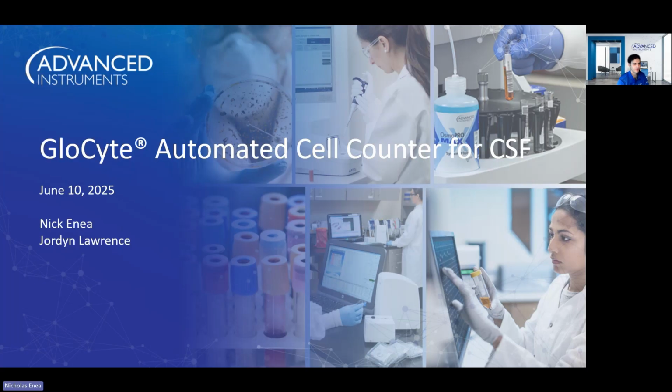I am the product manager for GloCyte, and hopefully we're all here today for the GloCyte automated cell counter for CSF. Today we're going to have a little bit of fun. I'm going to walk you through, didactically, all the use cases of GloCyte, how to use it, how it's run, how we see certain customers run it as well.